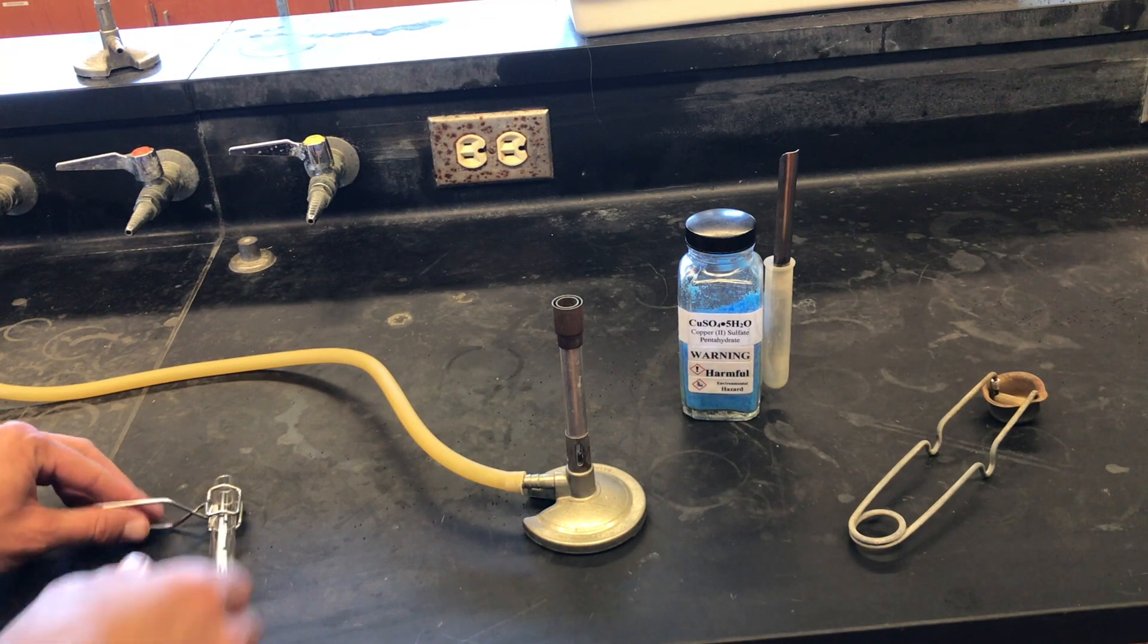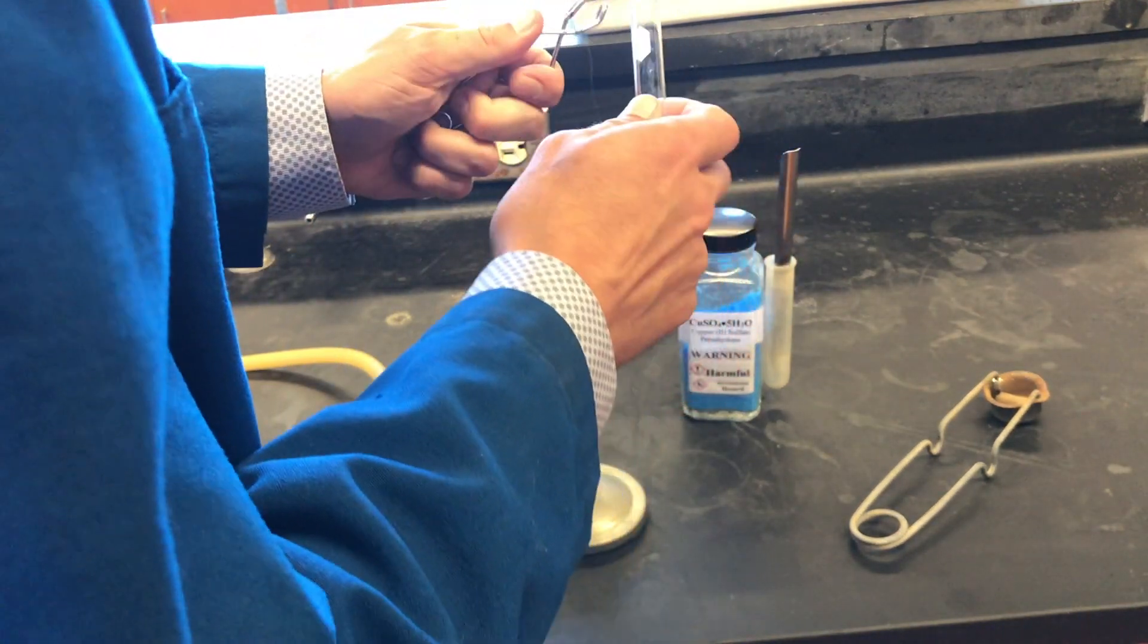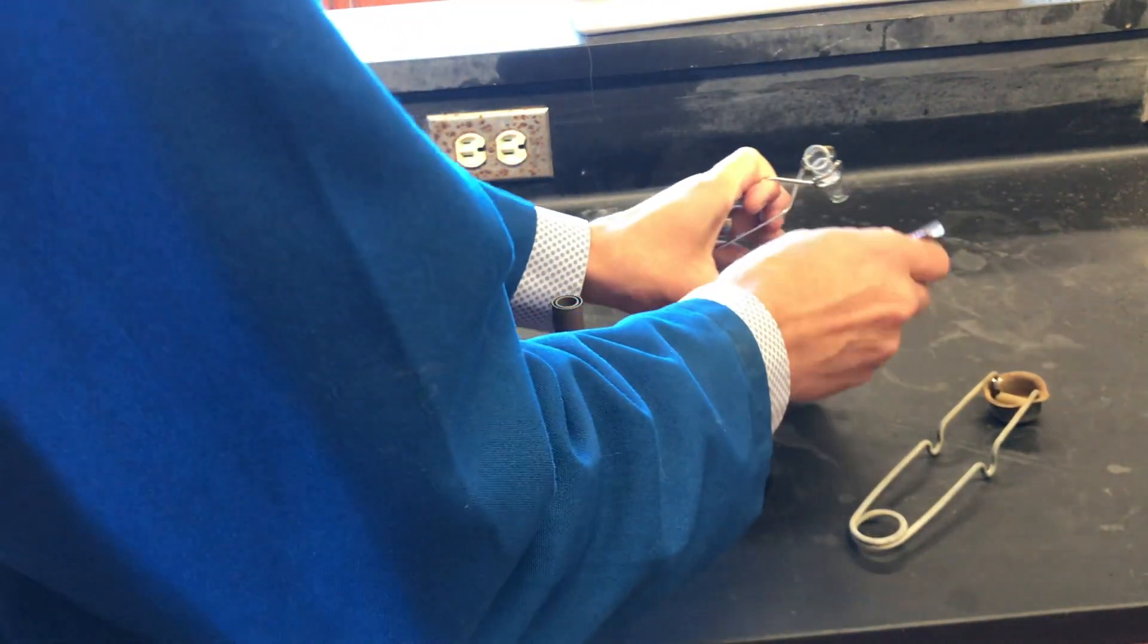Next, we're going to heat solid copper sulfate pentahydrate over a Bunsen burner. We're going to do that in a test tube and for safety purposes, we'll use a test tube holder.